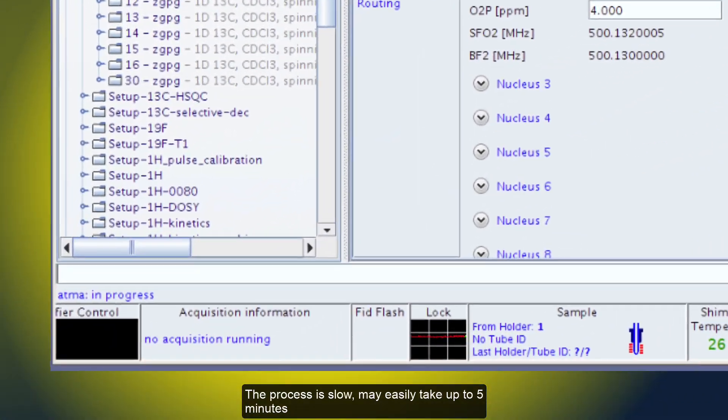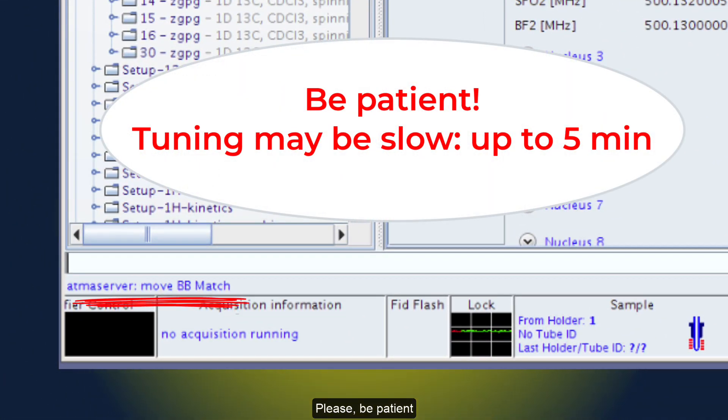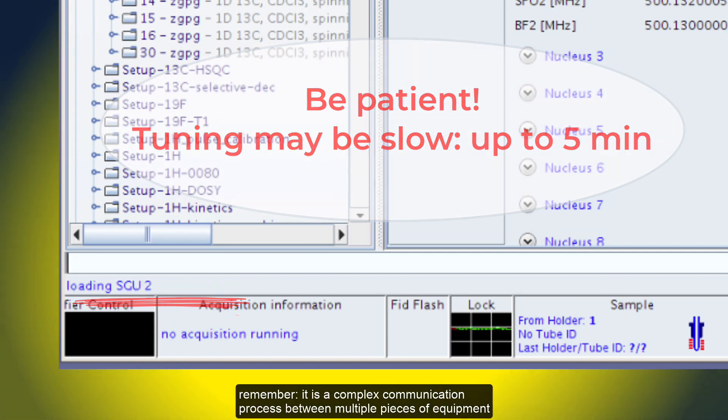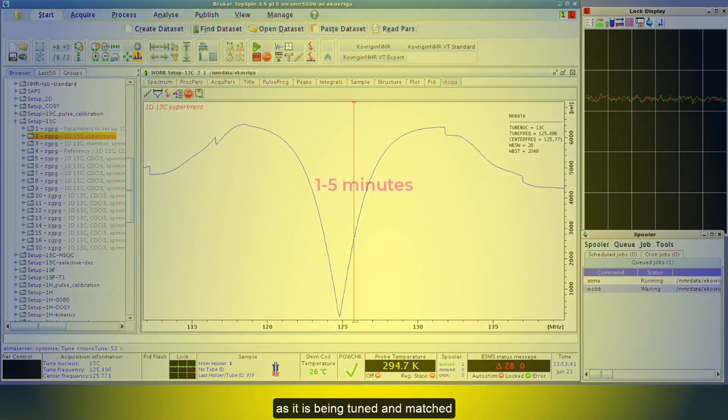The process is slow, may easily take up to 5 minutes. Please be patient. Remember, it is a complex communication between multiple pieces of equipment. At some point, the screen will show the resonance curve of the probe coil, as it is being tuned and matched.